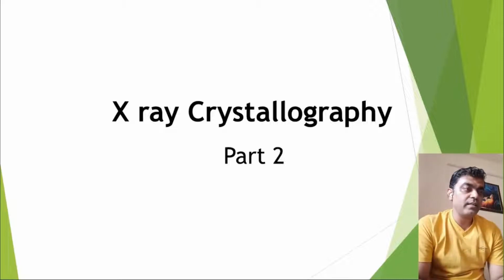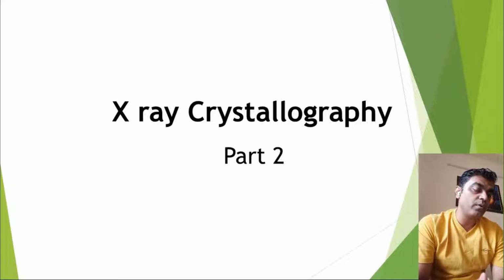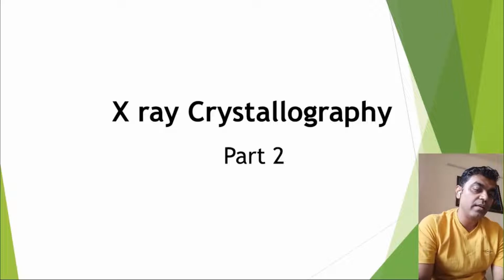So taking a step forward in that direction, today we will be focusing on how to understand a crystal, partly the lattice structures and everything which we have seen in a previous session.